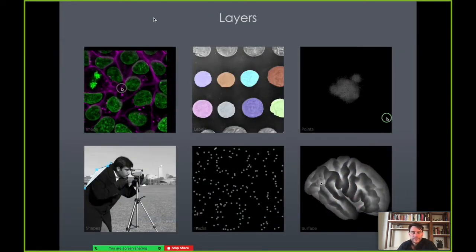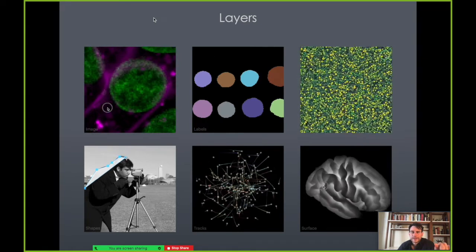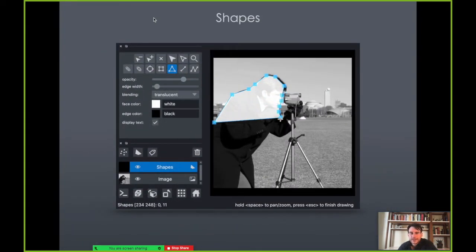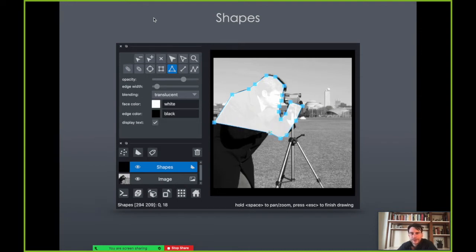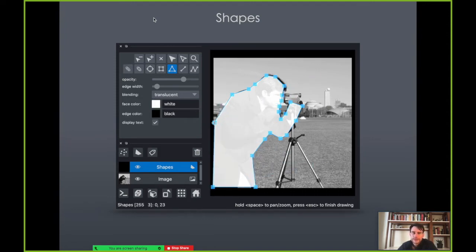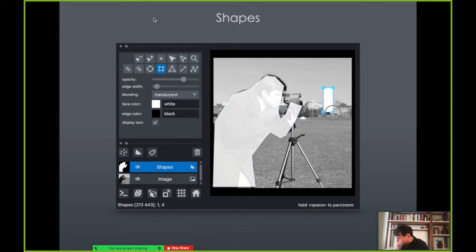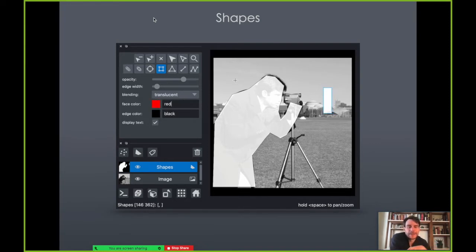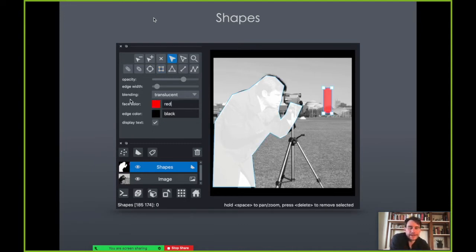Our final layer type is shapes. Here you can see shapes you can edit as polygons. If you want to do a segmentation around a region of interest using a polygon, that's possible. You can edit these polygons, draw additional ones, and edit their properties. For example, you can select a shape and then edit its color.